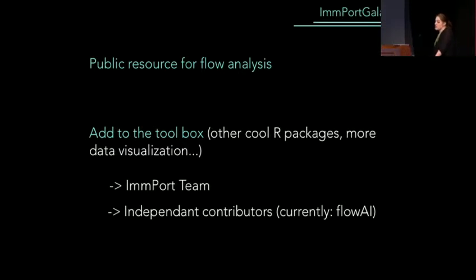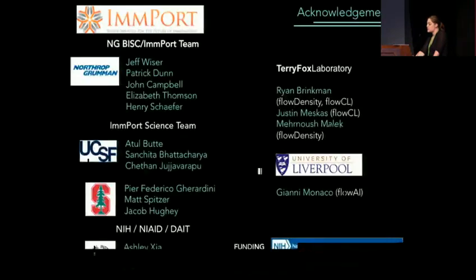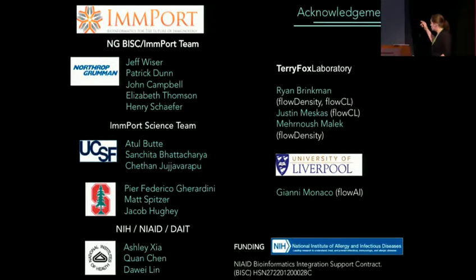But because this is Galaxy and this is open source, we don't want to be the only one working on it, and we really welcome independent contribution. And I do want to point out that the QC package that we have, it's called flowAI. The person who wrote it published his paper in April of 2016. We emailed him. He was super enthusiastic, and he did all the work to get the tool wrapped and up in ImmPort Galaxy.